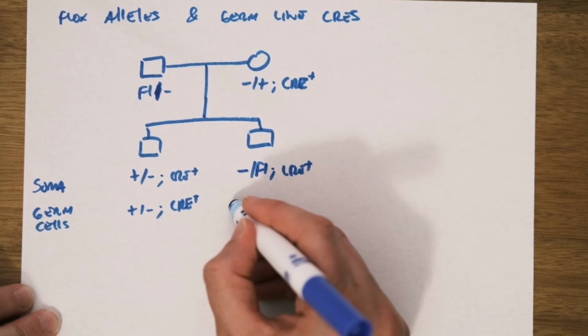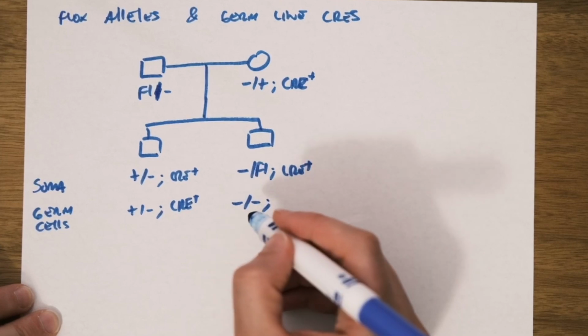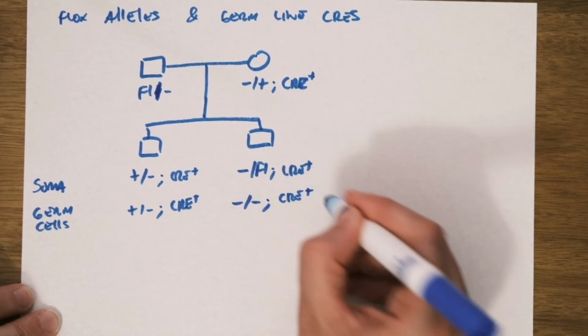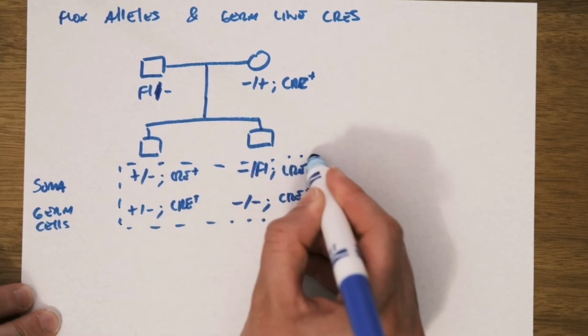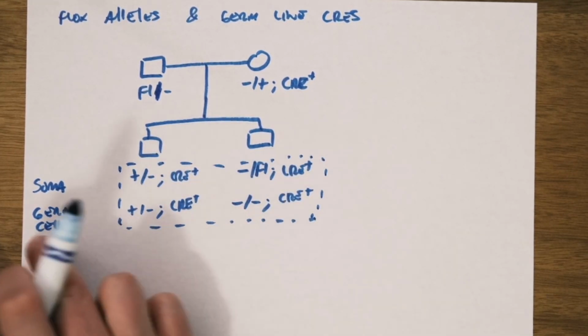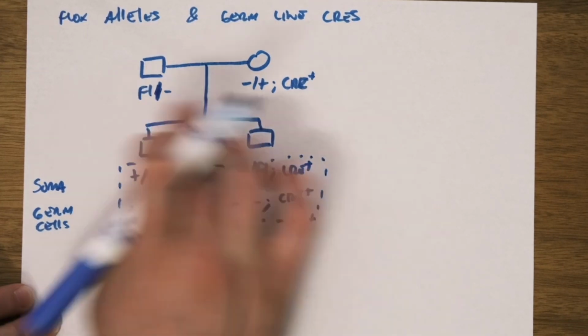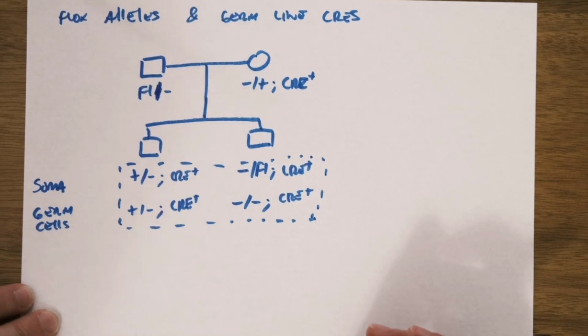In the germ cell, however, you have the conversion of the Cre, and you end up with the homozygous null if you have the Cre there. So these are the animals, and in the case of the experimental we have this chimera where you have the depletion in the germ cells. This strategy can be a little cumbersome and take a lot to get there.